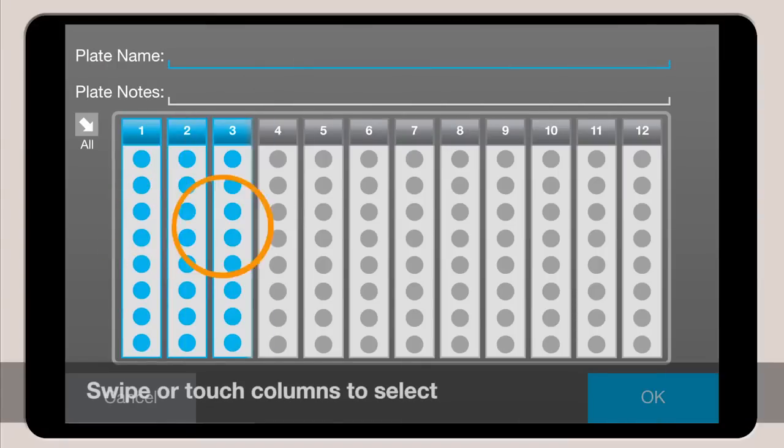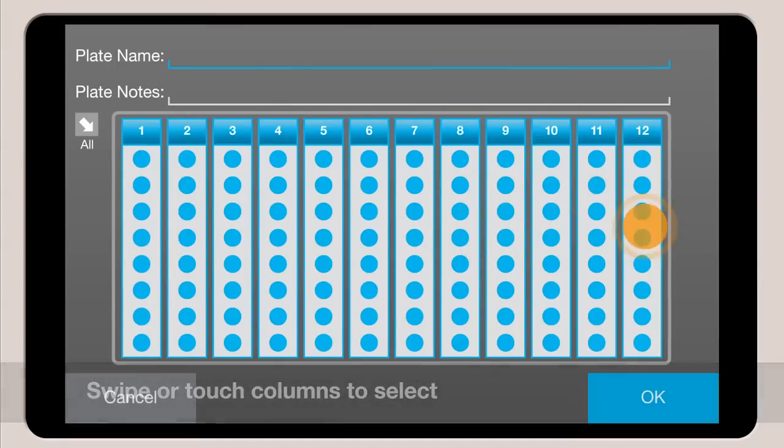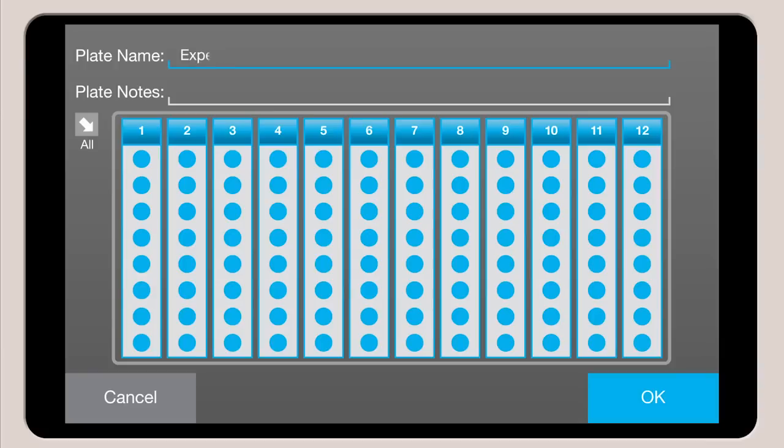Select the columns of your sample plate that contain DD-PCR reactions and enter a plate name and notes if desired.